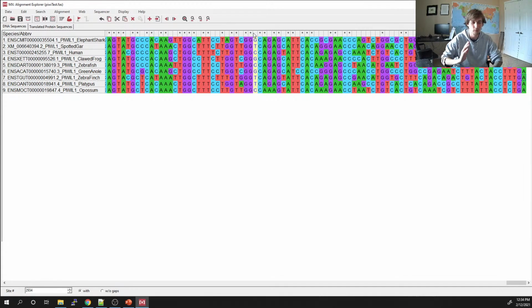So if the original alignment has 3,000 sites, the first bootstrap replicate will also be 3,000 sites, but we're going to sample each column with replacement. So we can sample the same column multiple times whenever we do a bootstrap. And then we're going to build a tree given that iteration. And then we're going to do it again. Each time we build a bootstrap replicate, we're resampling these columns with replacement until we get an alignment the length of the original, and rebuilding the tree.